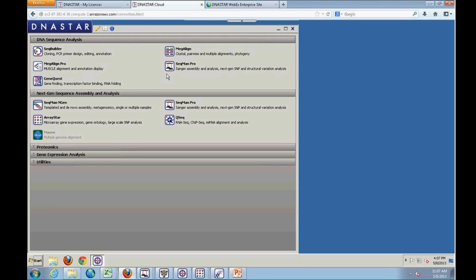What I can say is that the Amazon cloud has really strong security credentials, which is why we chose it to host our DNASTAR Lasergene software, and that we at DNASTAR cannot access your data once it's uploaded to the cloud. So really this is completely up to your particular organization to decide on whether cloud computing is going to be a good option for you. Here at DNASTAR, we just wanted to make sure that the customers who do want our software on the cloud and enjoy this cloud computing have access to it.